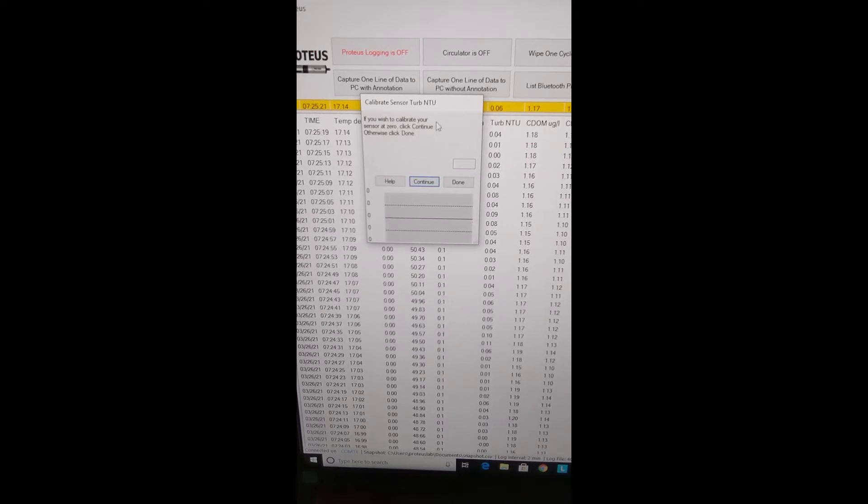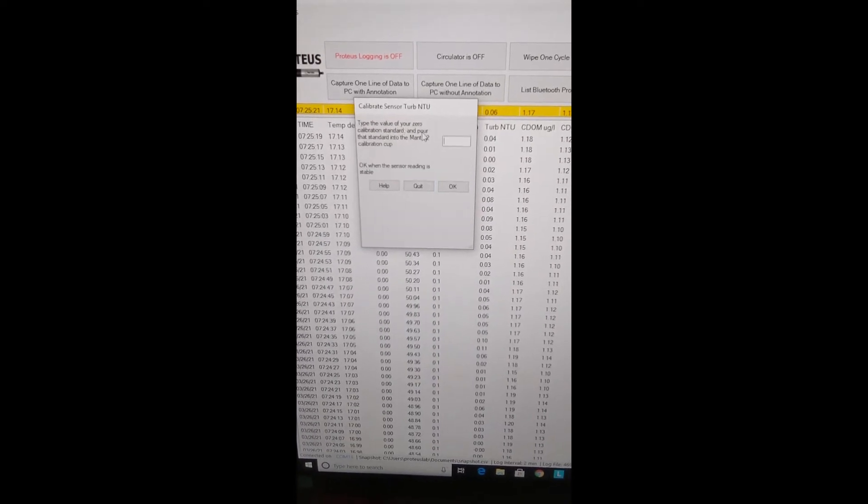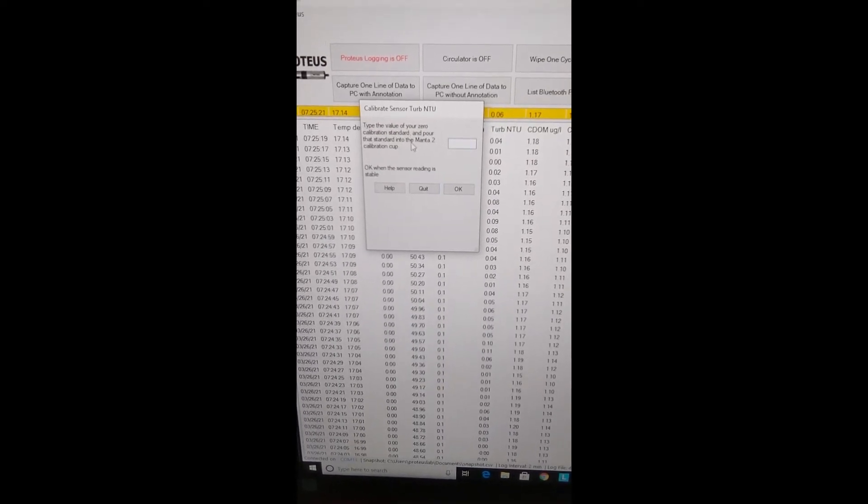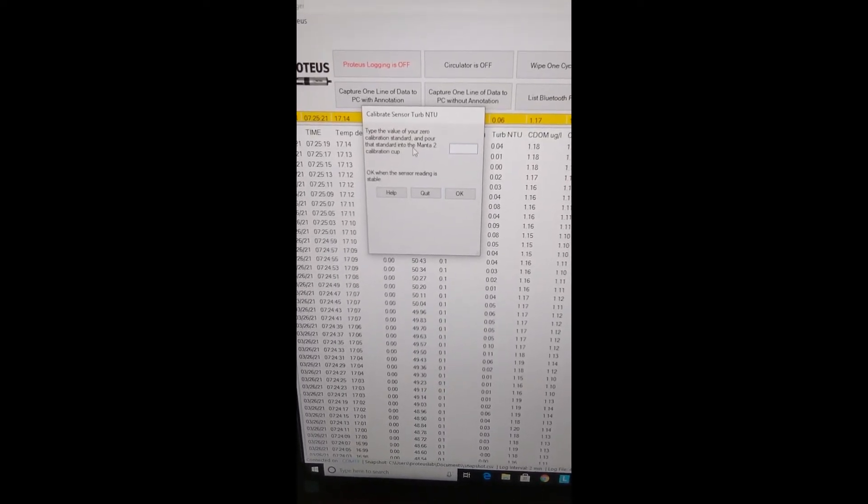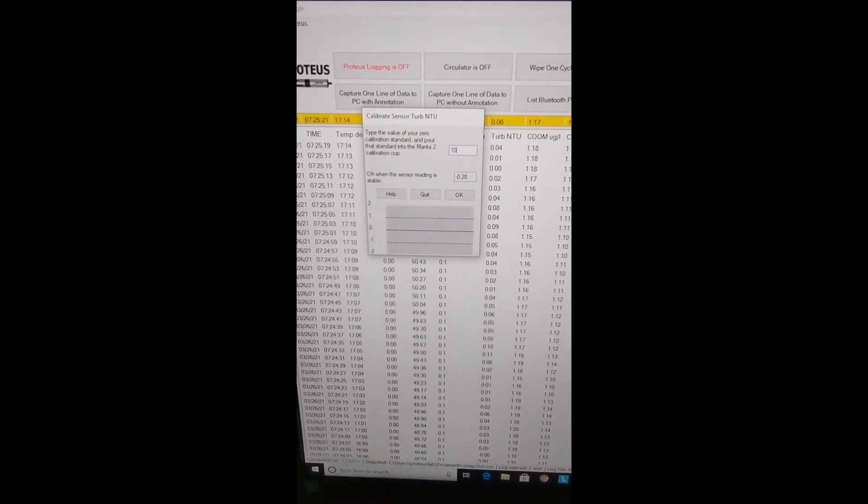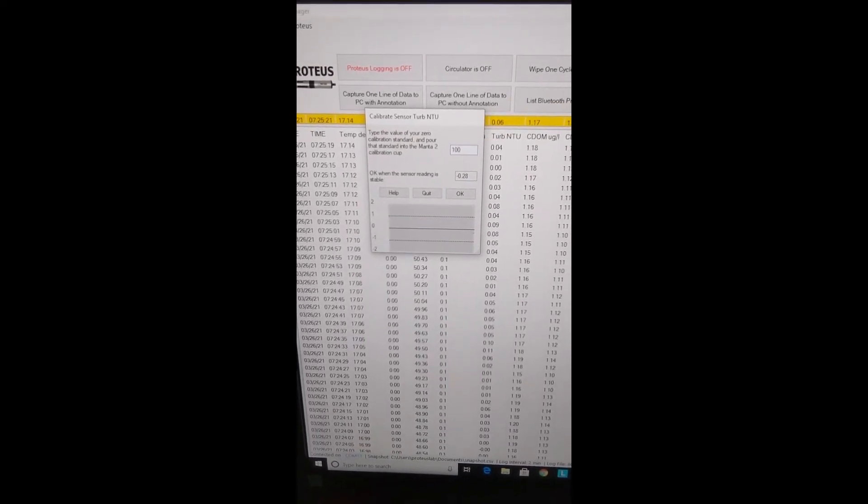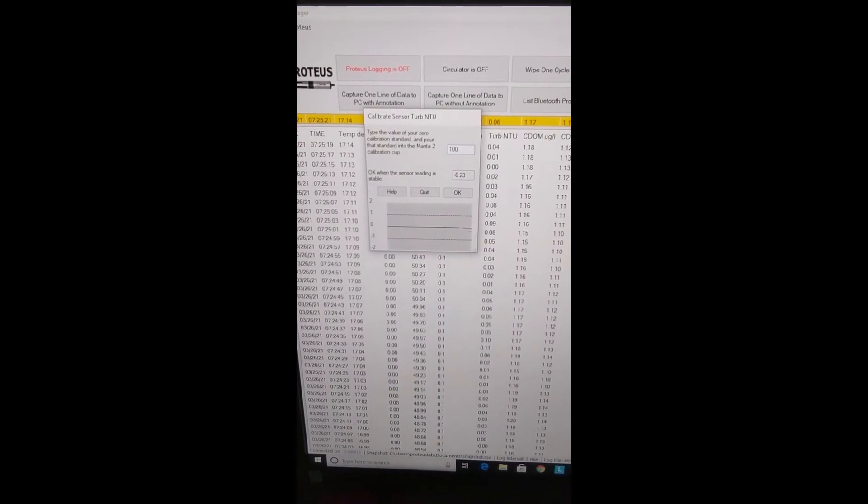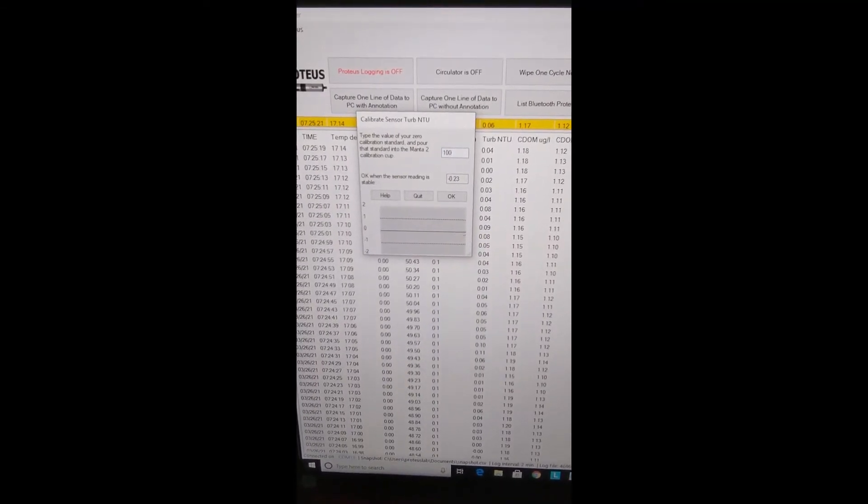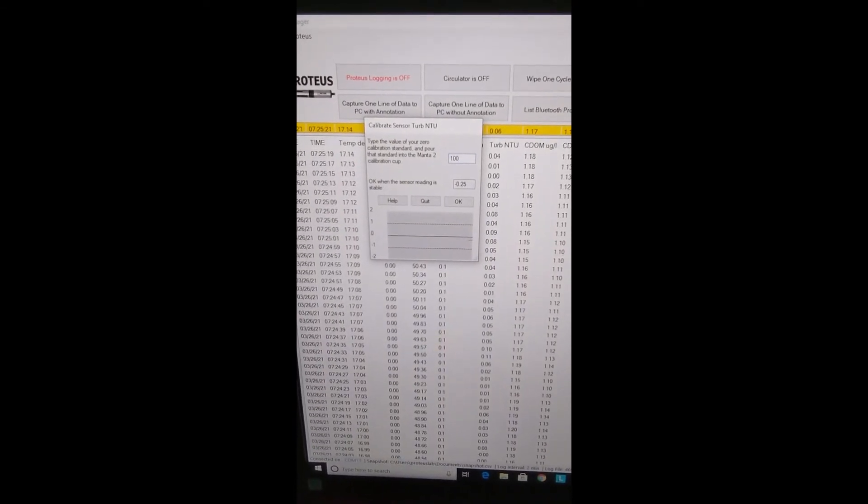It must be a two-point calibration, you cannot do a single point. So our next level is going to be 100 NTU, so I'm going to put that in there first and then we go back to the probe.